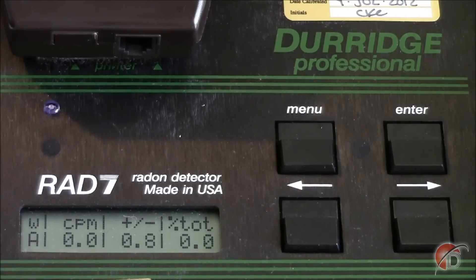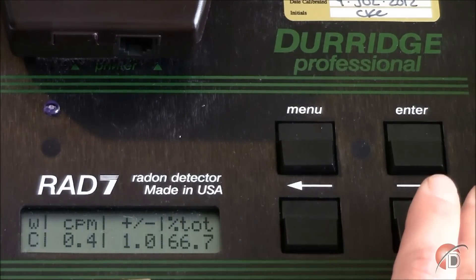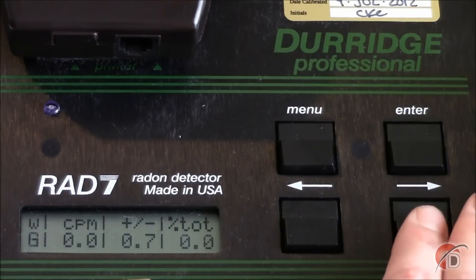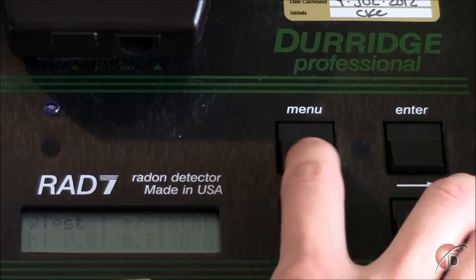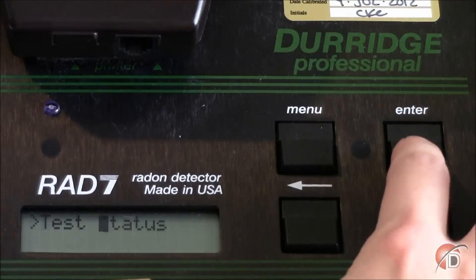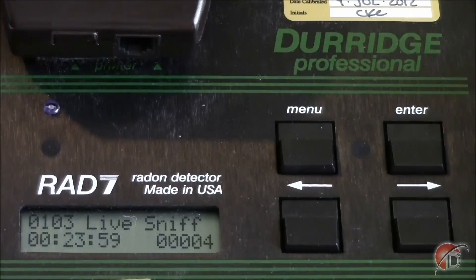The next menus show the data for each of the RAD7's eight counting windows. The displays show the window letter, the counts per minute observed in that window, the statistical uncertainty in counts per minute, and also the percent of the total counts during the test that fall within that window. Although the uncertainty reported on individual measurements may be very high at low radon readings, the uncertainty of the final average will be much lower and more precise. You may press the menu button to exit all of these displays. To return to where you can view the status of your RAD7 again, press Enter and at Status press Enter again.